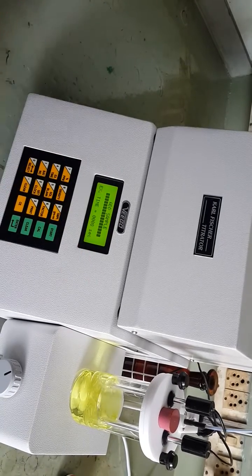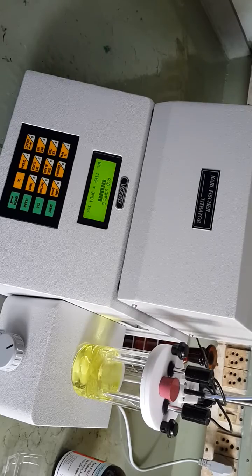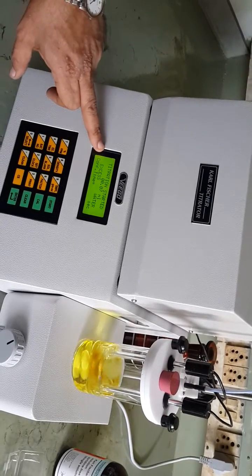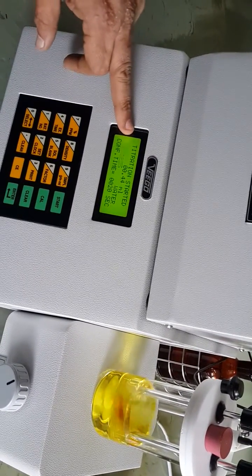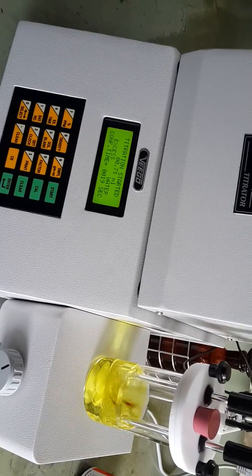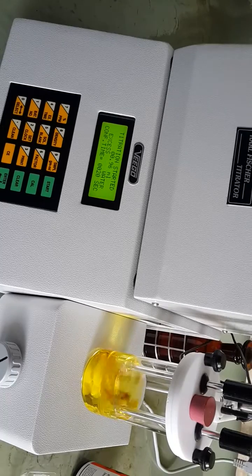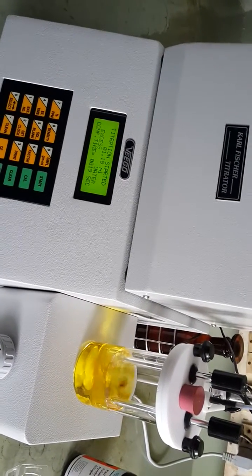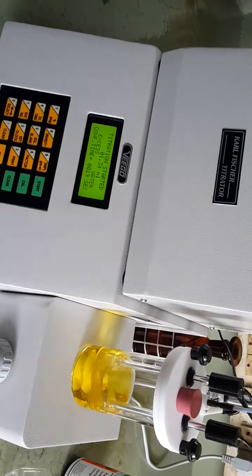It gives the message 'add sample'. We have already added the sample, so the titration starts as before. It detects the presence of water via the excess water signal. As soon as the excess water signal appears, reagent is added — it is now titrating the water present in the sample. Wait until the final titration is over, then enter the sample quantity in grams.